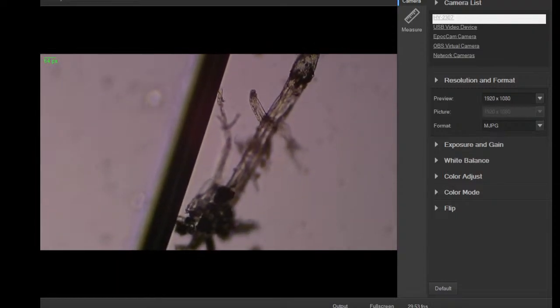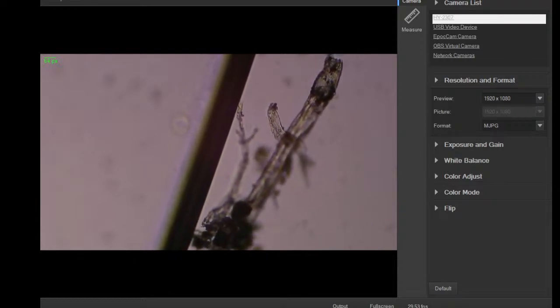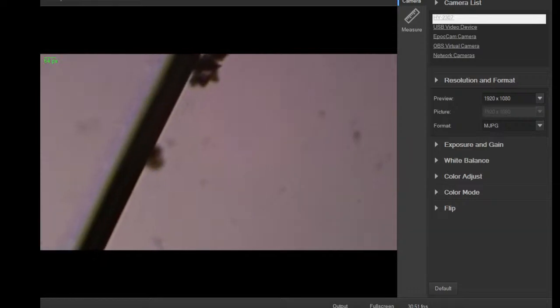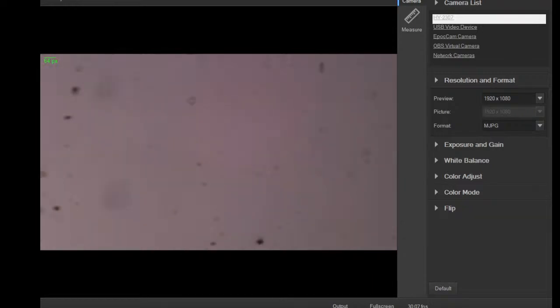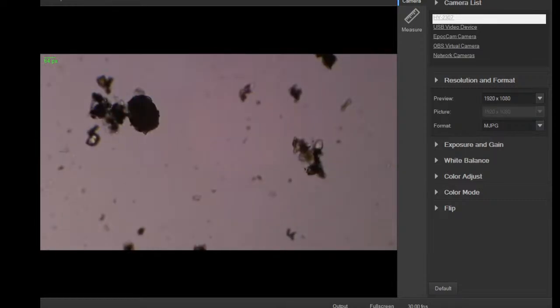So nothing cool here. It's more weird. There you go. See the water move? Look at that. There's evaporation. It's starting to squash things. You can really see it move. Another little bacteria next to it. They're kind of in a surge. They sit there, wiggle for a while, and then all of a sudden there's kind of a water surge that pushes them around. There's the end of the curve. Not seeing anything else down here.